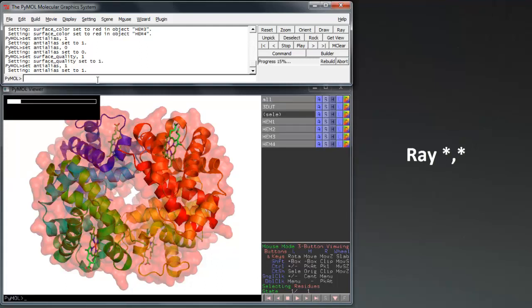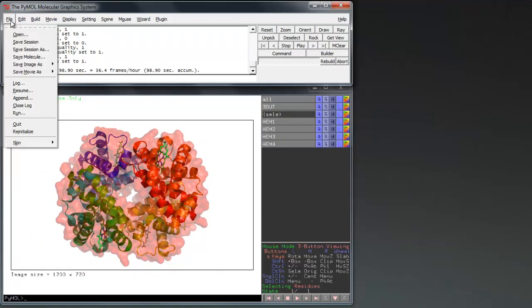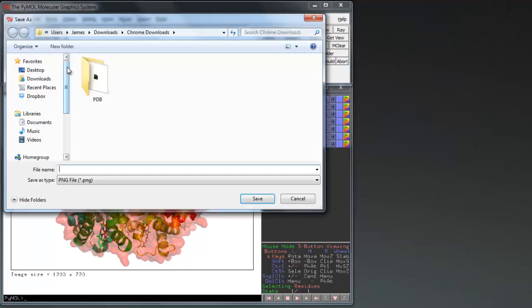In this case I want to produce a 720p image, so use ray 1200 comma 720. After ray tracing the image can be saved by file save image as .png.